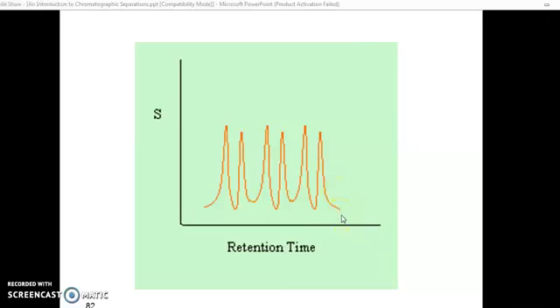Now the parameters, whatever parameters you define to change the chromatography, are resolution, band broadening, height, peak area and concentration, as well as, very important, what type of mobile phase you are selecting and what type of stationary phase composition. Stationary phase composition means what type of column you selected, polar or non-polar, isocratic or gradient systems.